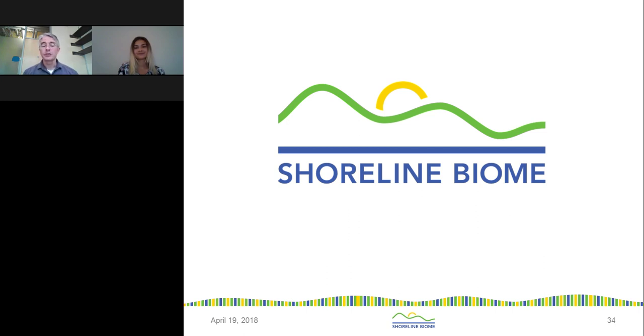So we tried a wide variety of different kits. Those results are currently being collated and published, or going to be submitted for publication very soon. And so we should see some more information out there about this. There's a number of publications that I didn't directly reference, but are in the presentation that talk a little bit about the lysis problem, or the missing Firmicutes problem. So it's something that's known. I think people have been working around it, and we tried our best to actually solve it.